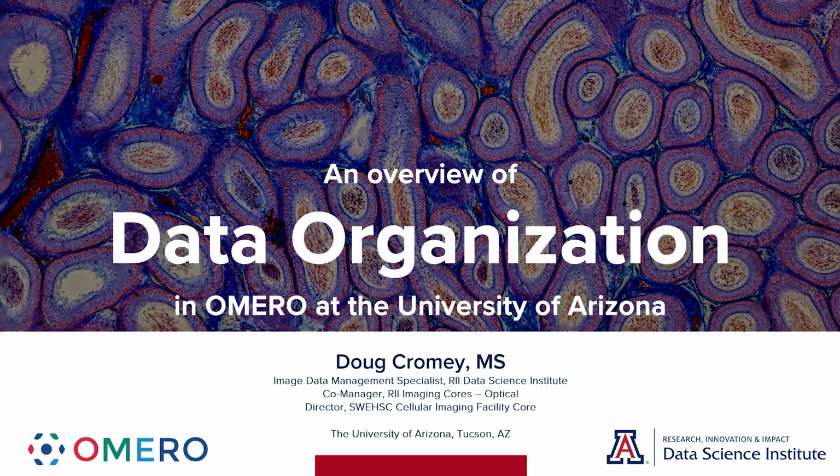Welcome. This video is the final video in a three-part series. This will be a quick introduction to data management for new users of OMERO at the University of Arizona.